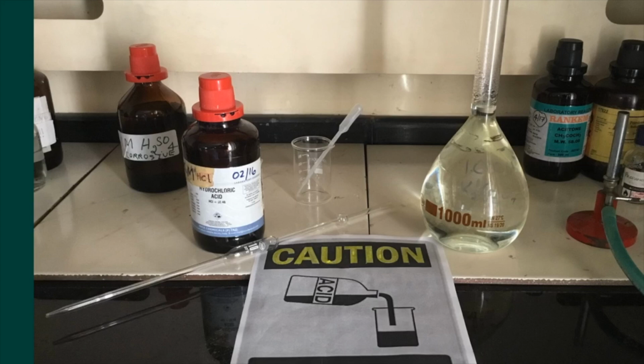So with this scenario, you must first fill your volumetric flask to about halfway with water, and then you take your pipette and extract 10 milliliters of 1 mole per dm cube hydrochloric acid, slowly introduce that into your volumetric flask, swirl and rotate with the cap on, and then slowly make up to the mark by adding water.